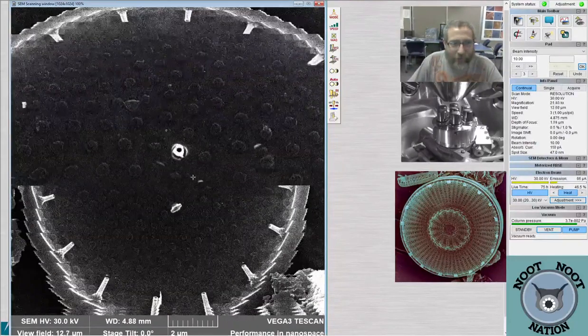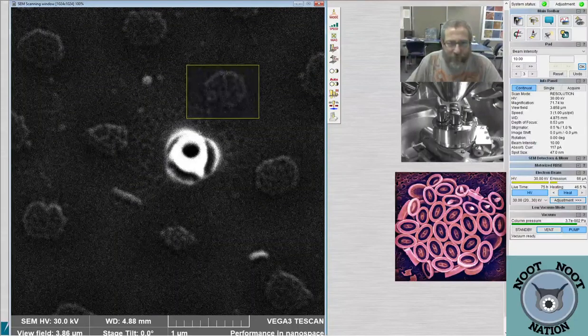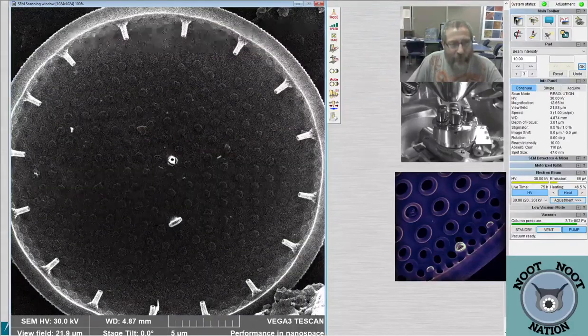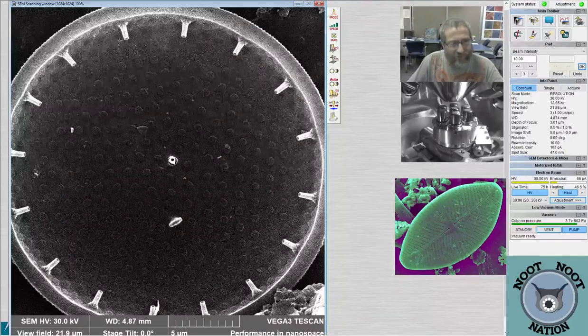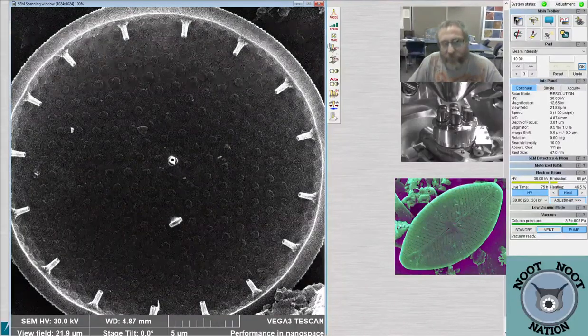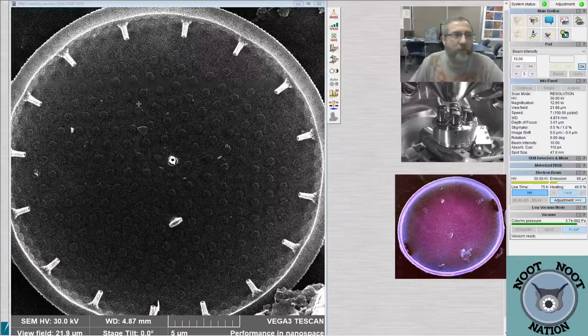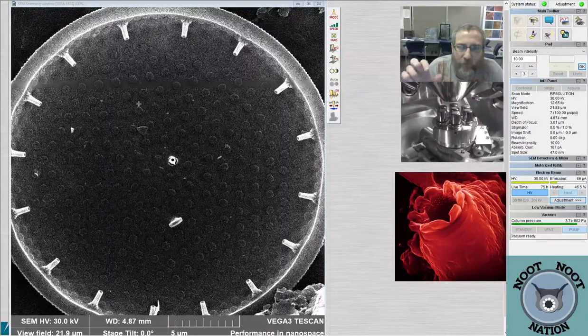So I don't know, maybe this is the weird little clock guy that we saw. The reason I think that could be possible is because you remember you could see slot-like things coming down into the actual valve, and these internal strutted processes are super weird. They extend super far in. So let me see if I can fix some of this. We need to do that, and then it's a little over-brightened. So in a light microscope, you would be able to see those extensions of the fultoportulae coming into the actual valve, because they're so long, they would leave a shadow or a bright spot or whatever.